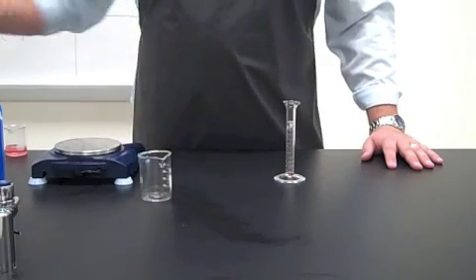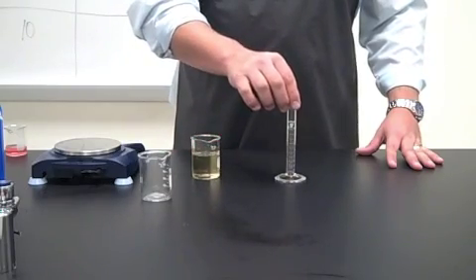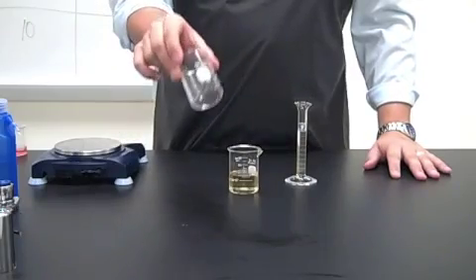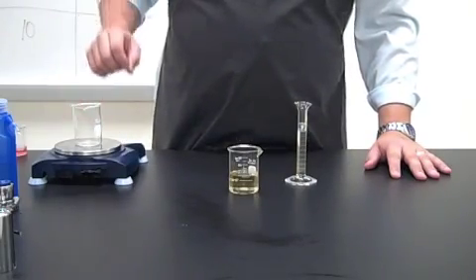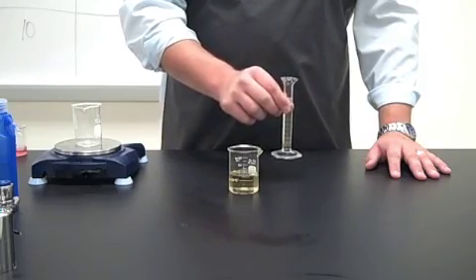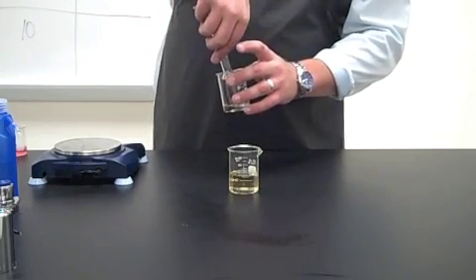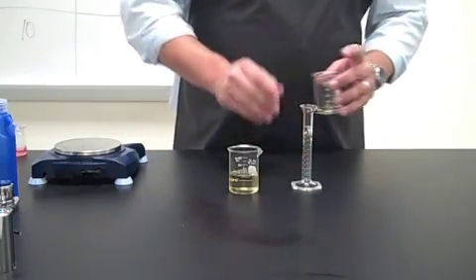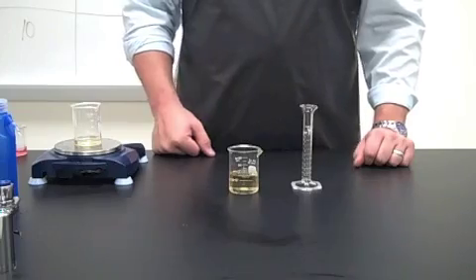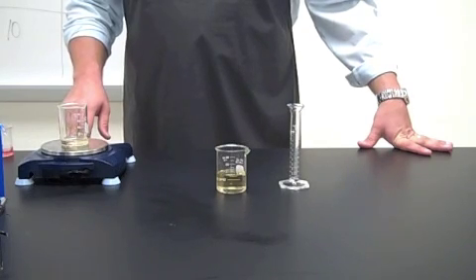Now we're going to test our other unknown sample, which is our apple juice. We're going to pour it in our graduated cylinder, and we're going to get 10 milliliters. We're going to again take our beaker, put it on the balance, zero it out, and add our 10 milliliters of apple juice. And record the mass. And we see that the mass is kind of going back from 24 and 25, so we're going to go ahead and say that it's 10.25 grams.